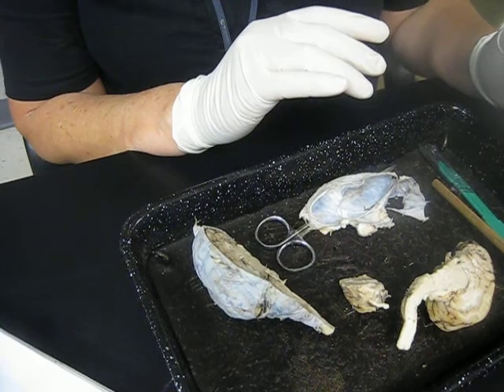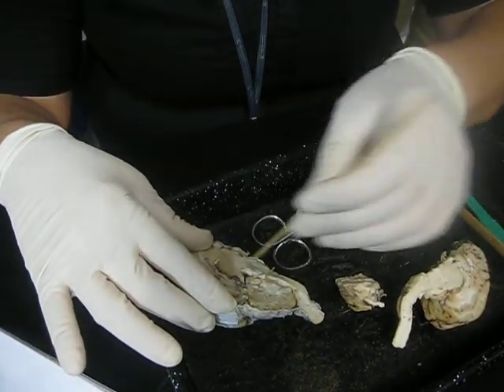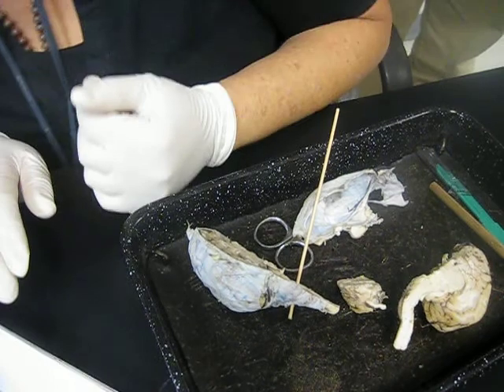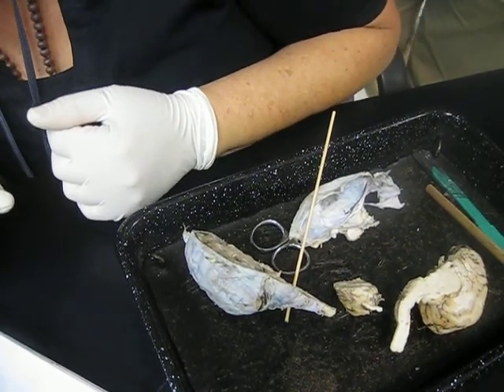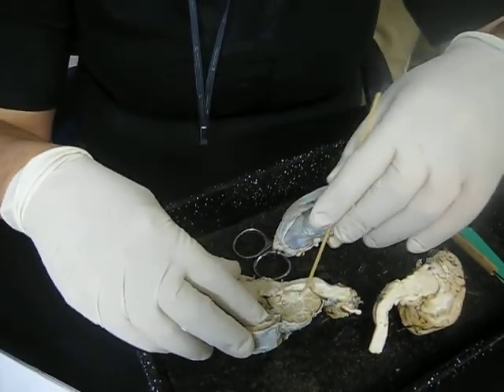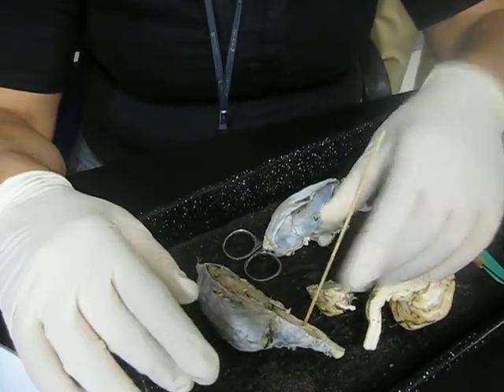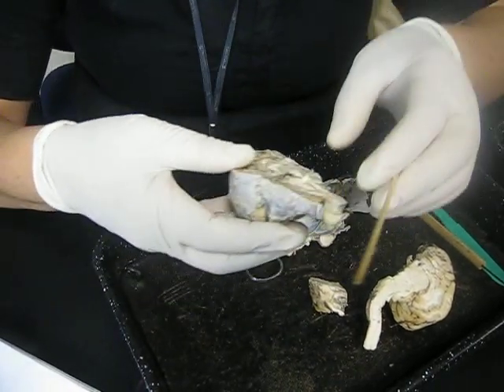Is the 4th ventricle the only ventricle we have to know for the practical? The lateral and, on the sheep brain, the 4th. The lateral. See? Corpus callosum and then the lateral. Oh, they're not telling you. Okay. You should know it. Okay. That's easy. That's the lateral, and that's the fourth. And I showed you the pineal body, the pineal gland.